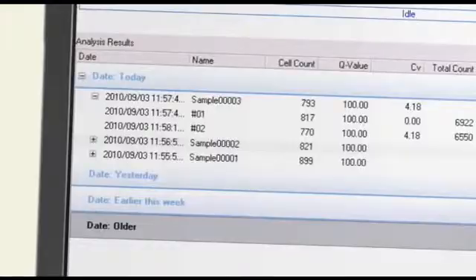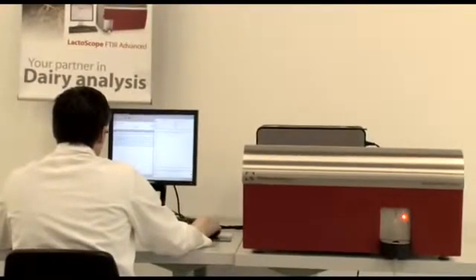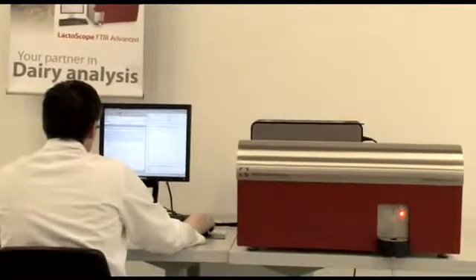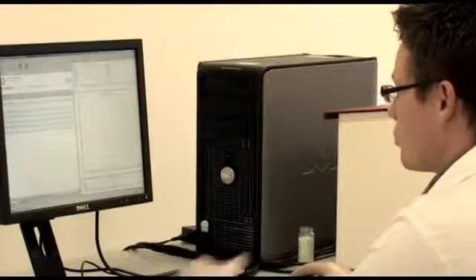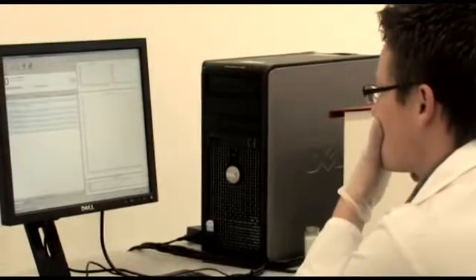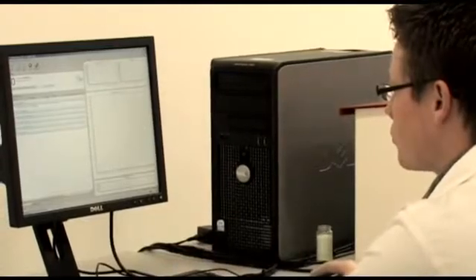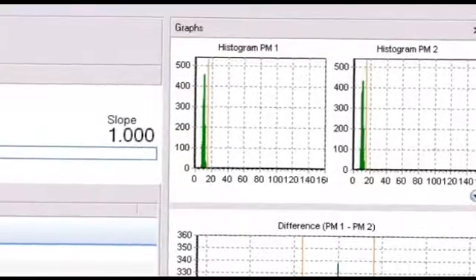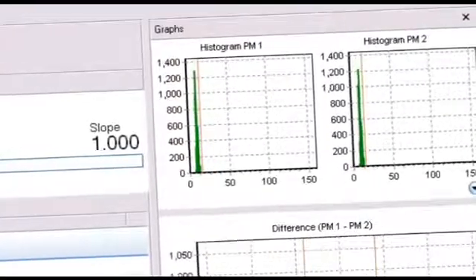The SomaScope Smart uses a so-called secondary method. Therefore, it needs to be calibrated against reference samples, which are analyzed using a primary method called direct microscopic somatic cell counts. The user starts the calibration by choosing the calibration wizard. The reference samples are measured. After analyzing them, the instrument needs to be cleaned.